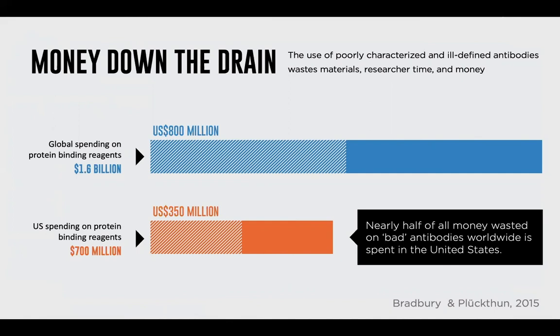And you can see in a lot of the actual sheets provided by the vendors themselves that they often reuse the same results over and over again. Instead of updating with every single batch, you essentially do the test once, and then they assume that that antibody is going to work the same forever. So that means that there are a ton of bad antibodies out there.